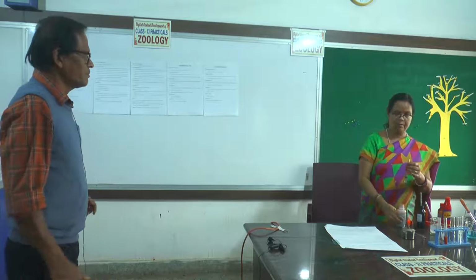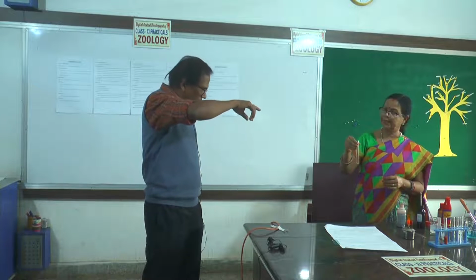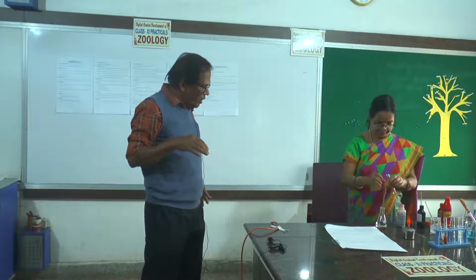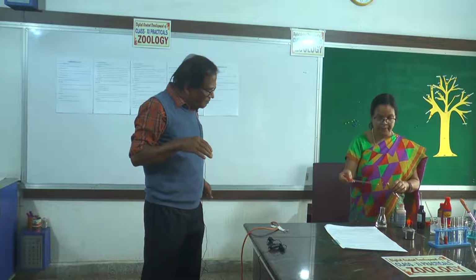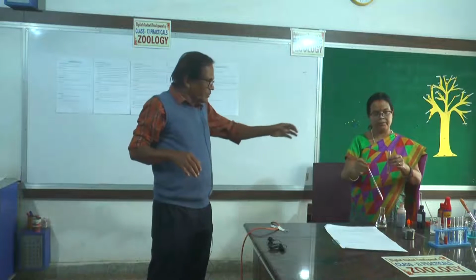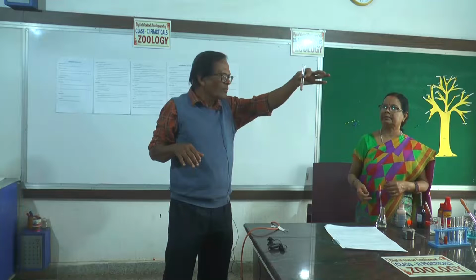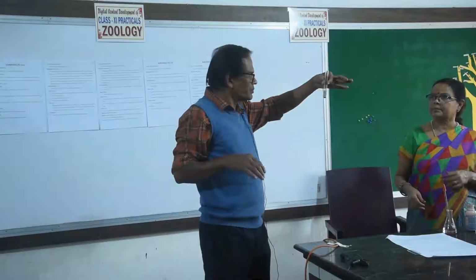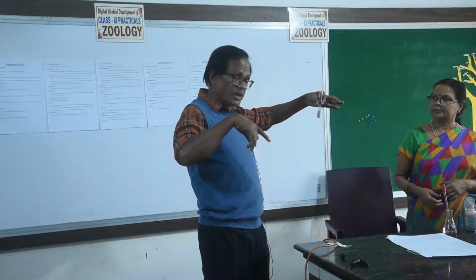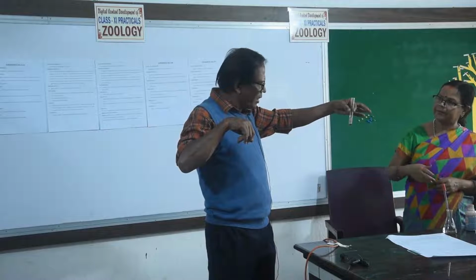Please. Molisch test, don't say it. No. Then roll down sulfuric acid. Yes, you can roll down. Anyway, it's done. The previous one that we did, the photograph was better. Let's go back.